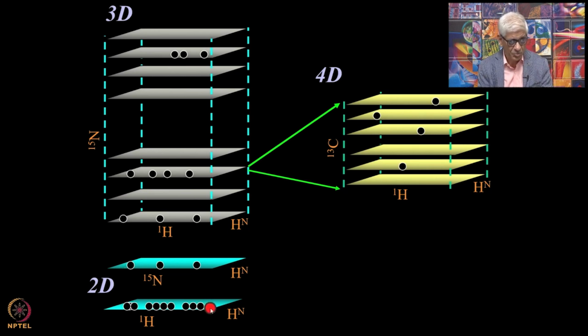So you have 3 peaks which are present here, and now what you do is, instead of making just a 2-dimensional spectrum, HSQC-TOCSY or something like that, instead of spreading them along the proton axis, extending the proton axis here, we actually pull this spectrum along this axis. In the 2-dimensional spectrum, we would pull this in the HSQC-TOCSY or HSQC-NOESY to include the proton chemical shifts more here.